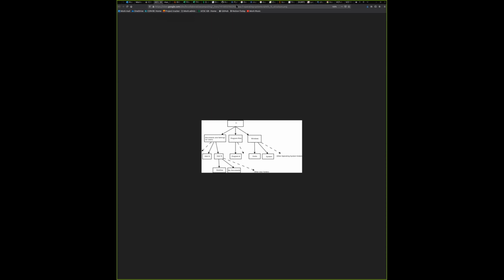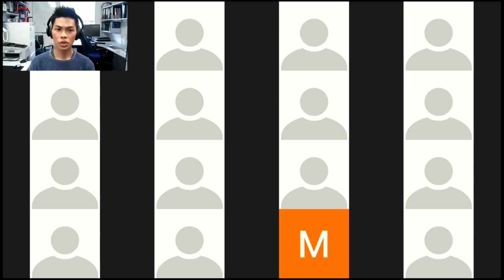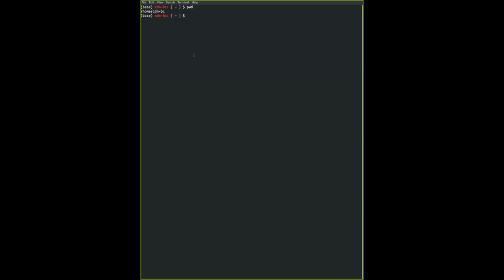For those using Git Bash, I'm going to show you a way to actually go into root. You don't see root in the image I showed you just now, but because Git Bash creates this UNIX file system, you will see what the root looks like on your computer. So I'm going to share my terminal again, and then we can continue.